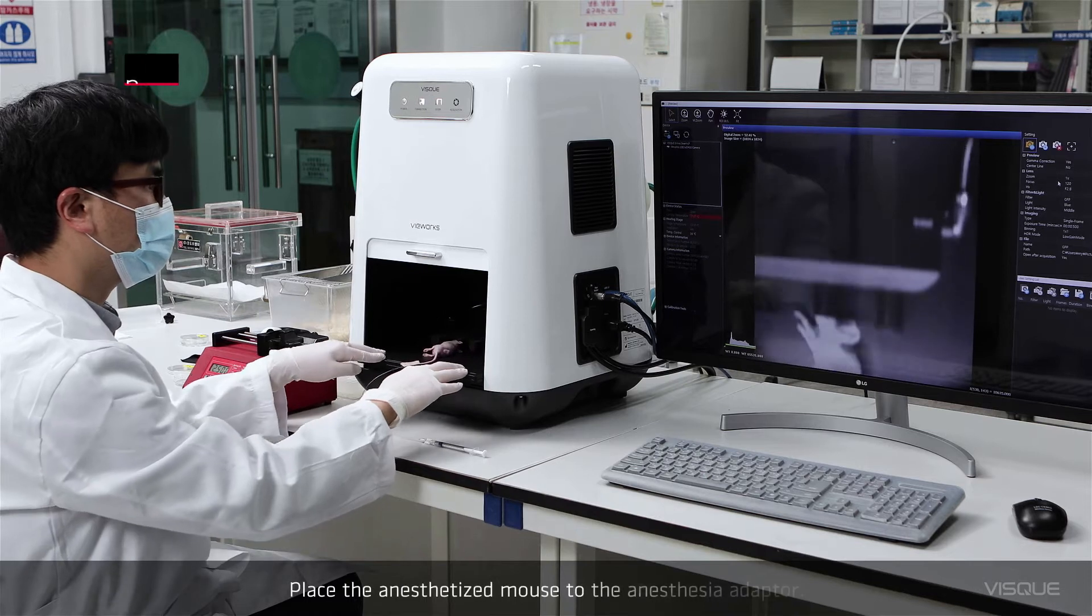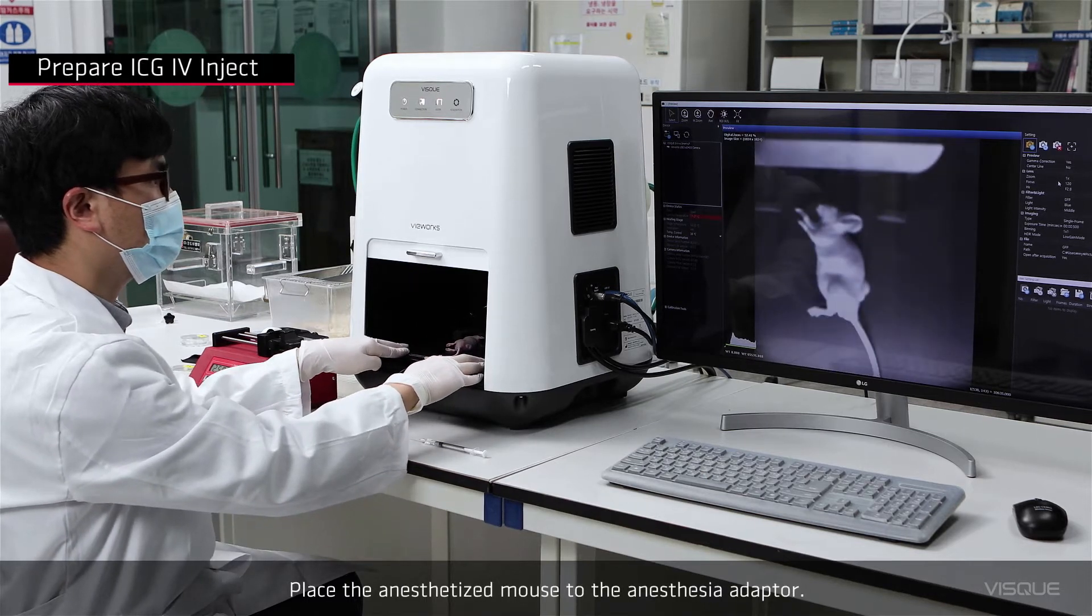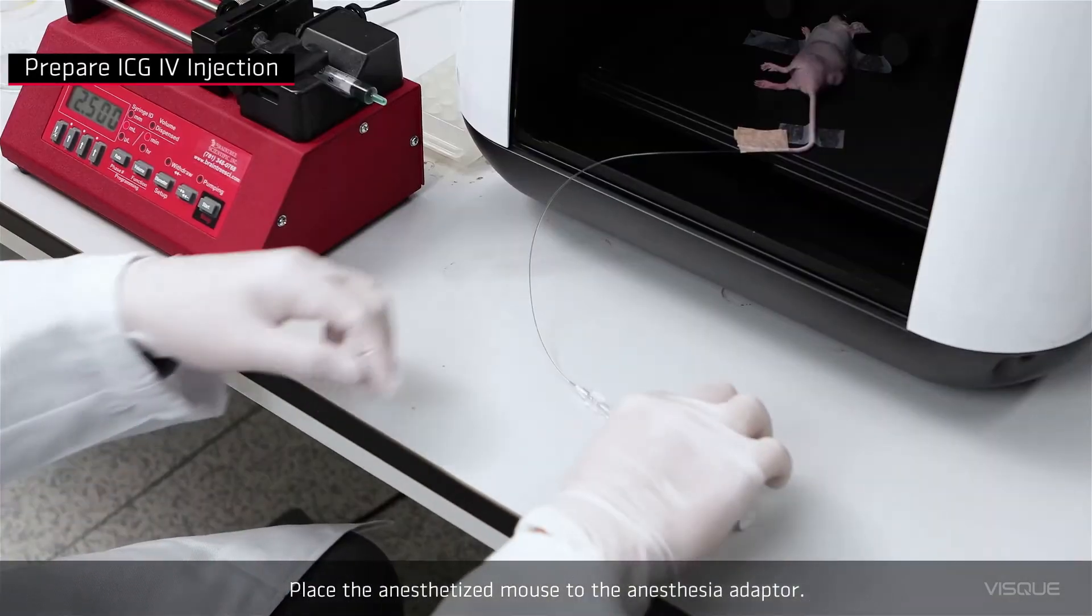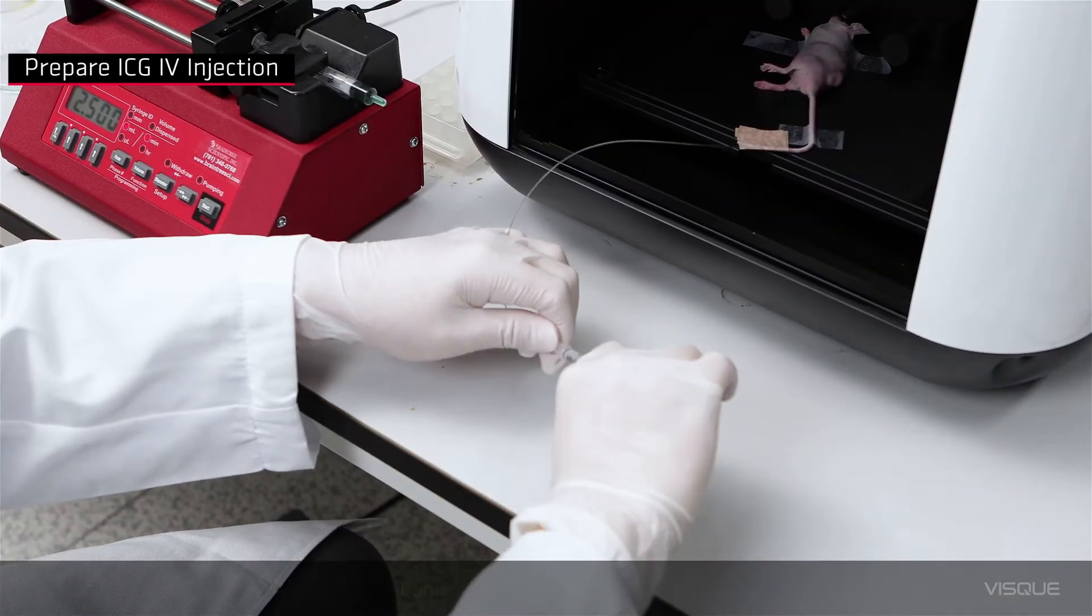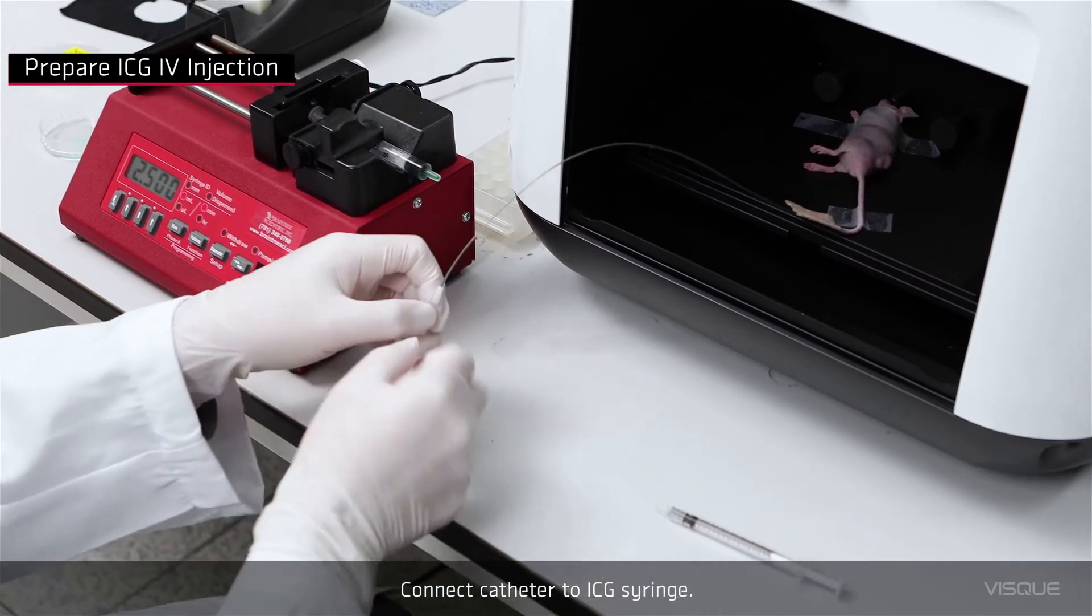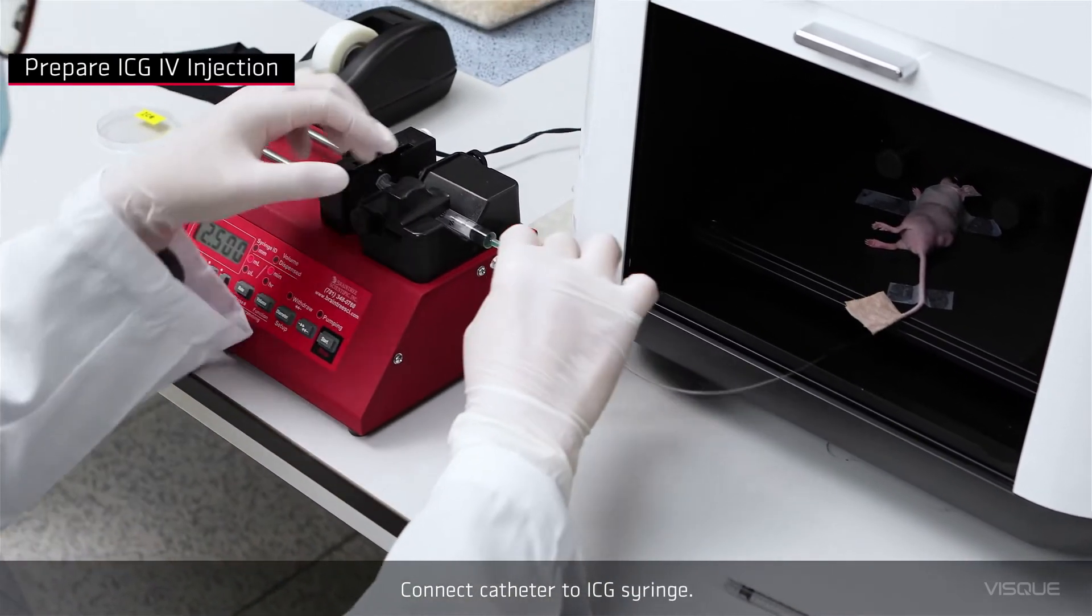Place anesthetized mouse to the anesthesia adapter. Connect catheter to ICG syringe.